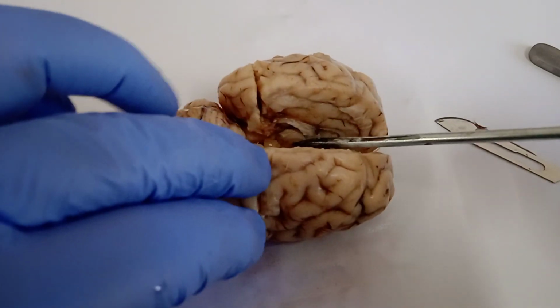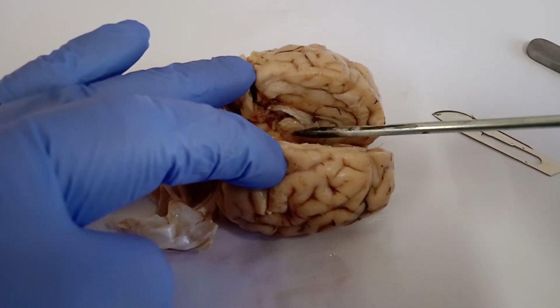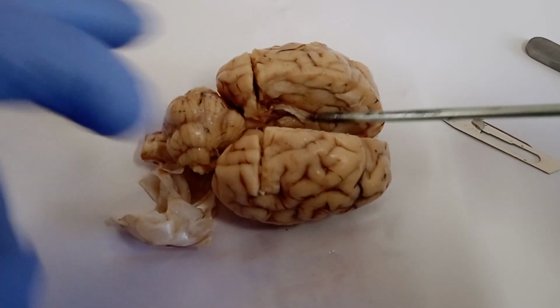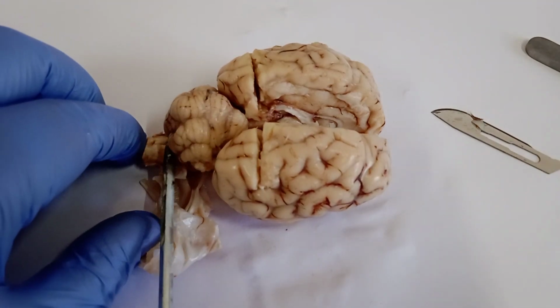One will be the third ventricle, because this is the pineal gland, and this rounded mass you see here is the thalamus, and underneath the thalamus will be the third ventricle. And one more ventricle will be underneath this cerebellum. So here will be the fourth ventricle.